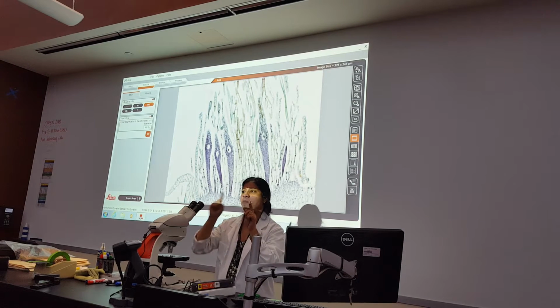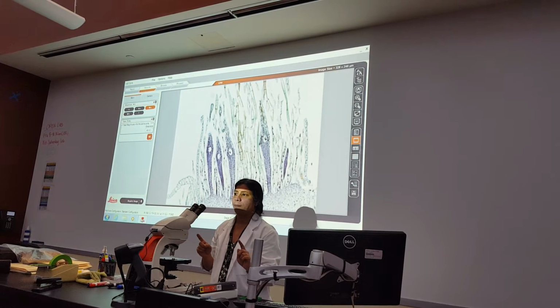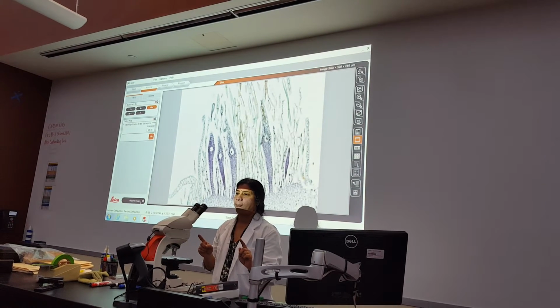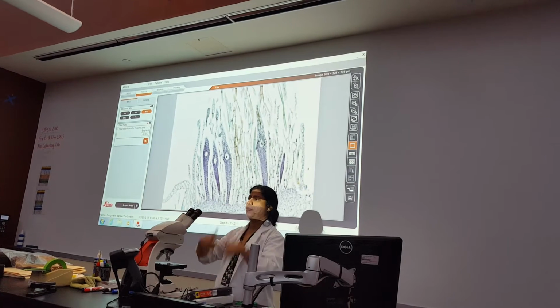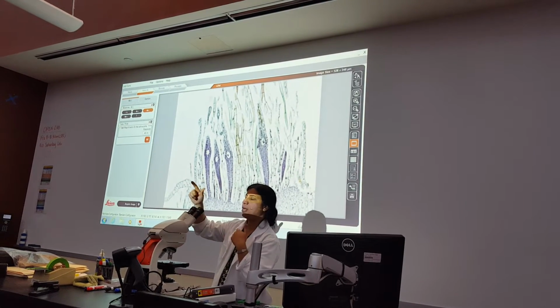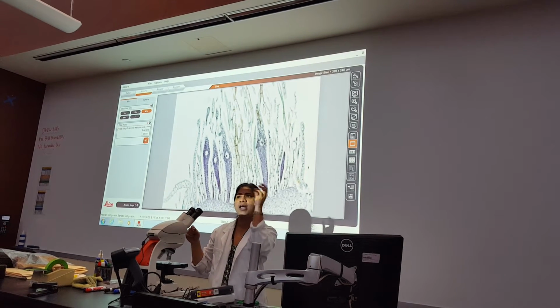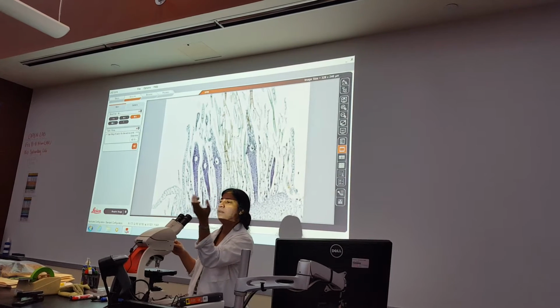What is the difference between moss Archegonium and Marchantia Archegonia? Shape. Moss Archegonium is standing up. Marchantia Archegonium is flipped down. Remember that. So you see two Archegonia. If it is hanging upside down, it's Marchantia. If it is standing up, then it is moss.